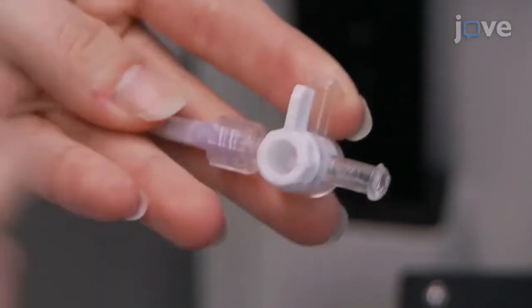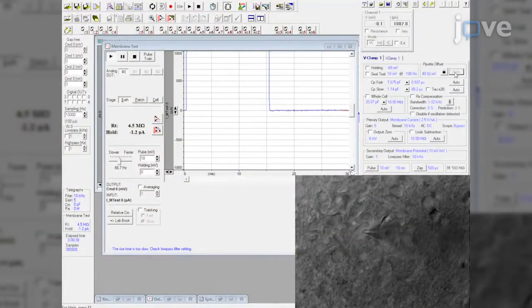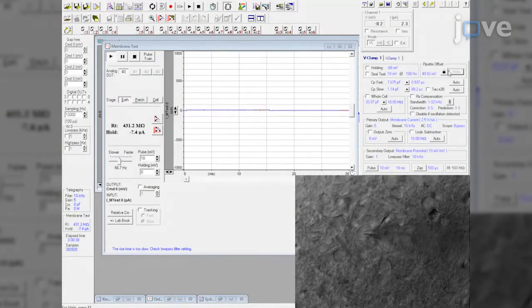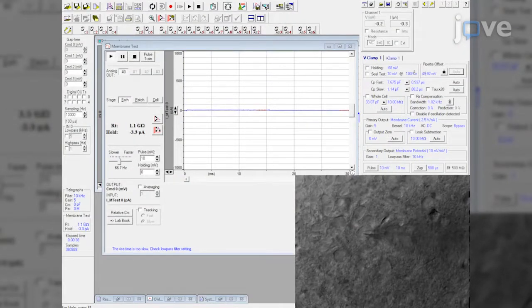Then release the positive pressure lock. The cell will begin to form a seal and the resistance will increase above 1 giga-ohm. In voltage clamp, hold the cell at minus 68 millivolts.